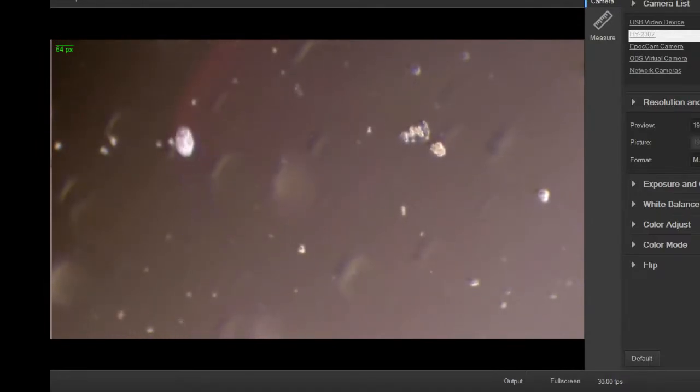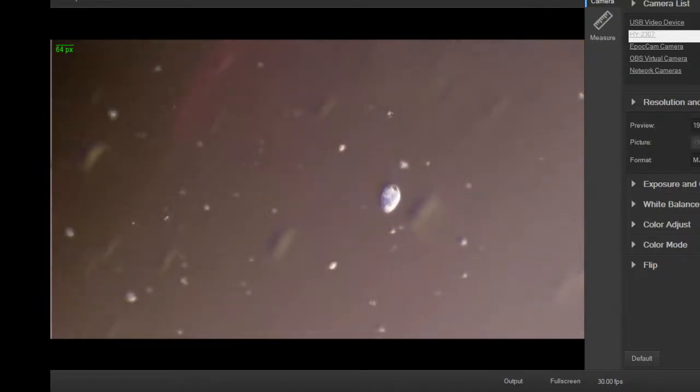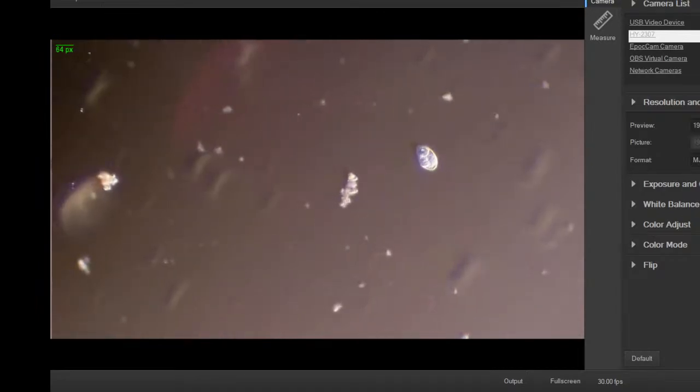Like fungus from a bell pepper. Or cheese fungus. I did a show a while back. I did some cheese fungus. It was quite nice. The bell pepper one was fun, though, because I actually smashed it a little bit. Put it on this proper compound scope and not the dissecting scope. And you can actually see the sporangia. These little clusters look like hand grenades. It's really interesting. Look at that guy go.